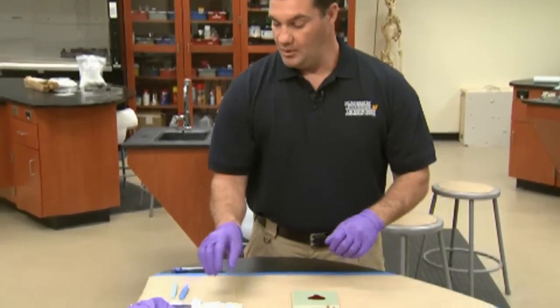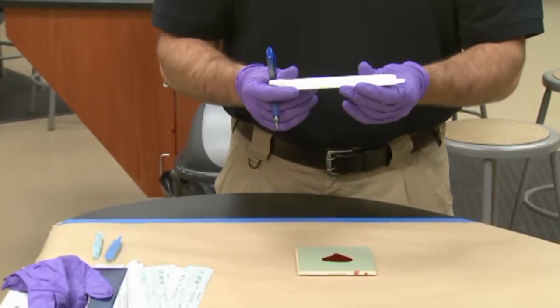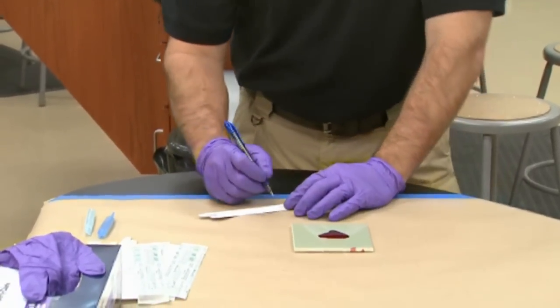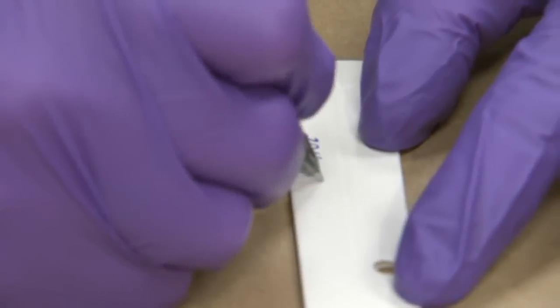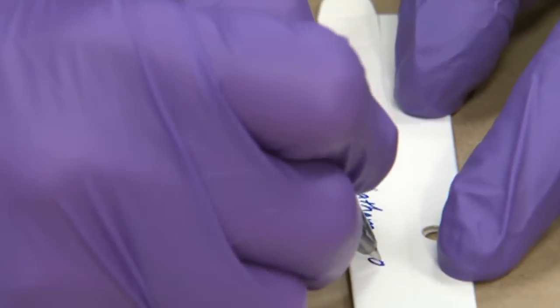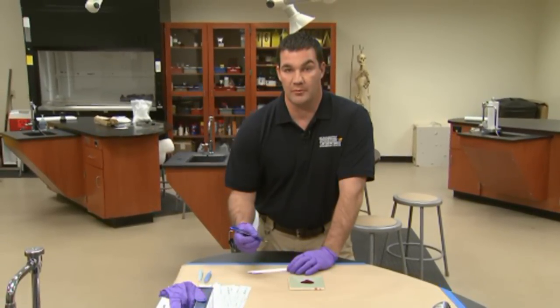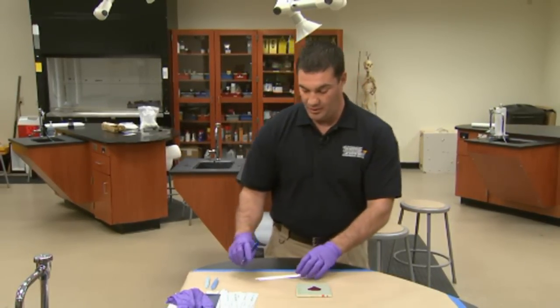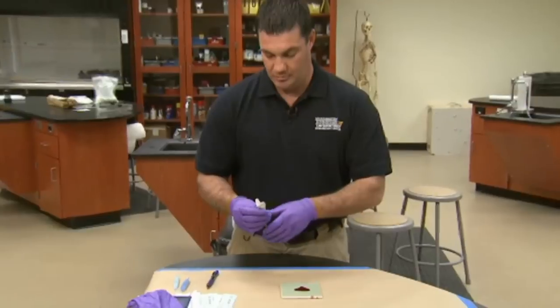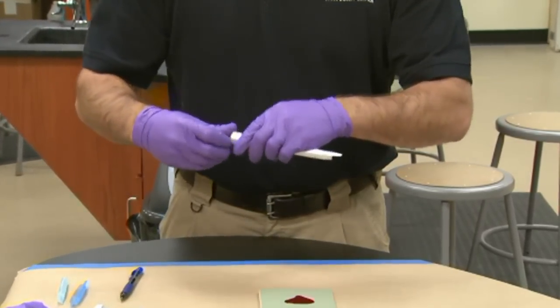For wet blood collection, the first thing you're going to want to do is fill out a swab box. Swab boxes are commercially available and are very useful for containing the swabs you've collected samples with. It's easiest if you fill out the information on the swab box — such as the case number — before going into the collection of the sample itself. The information that should go on a swab box includes the case number, the date, some people prefer to put the time of collection, and your name and item number at a minimum. Once you've filled out the swab box, close one end and prepare it for collection.